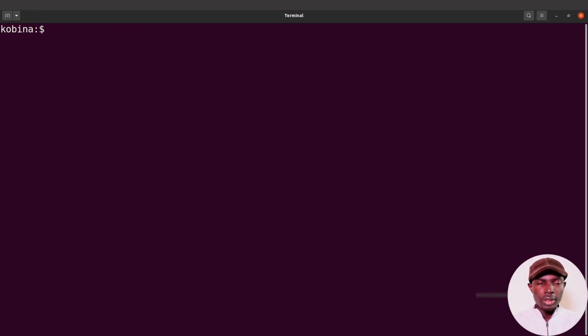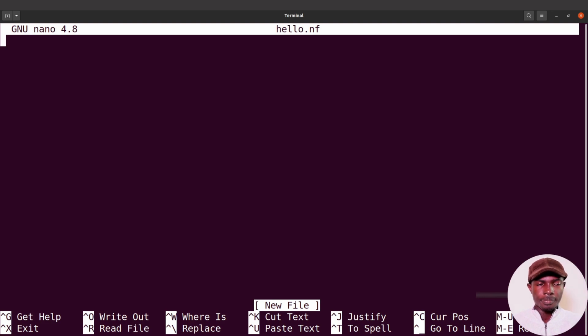So we are going to create a hello world script. We are going to use a text editor also. For text editor, I prefer to use Nano, but you can use Vi. So let's do this. Let's say nano hello.nf, and then let's open it.